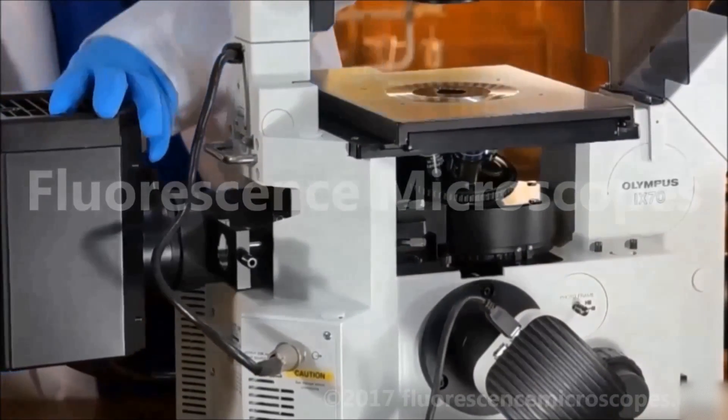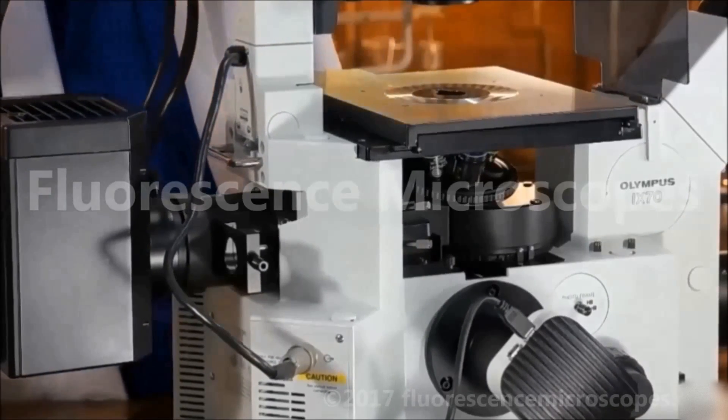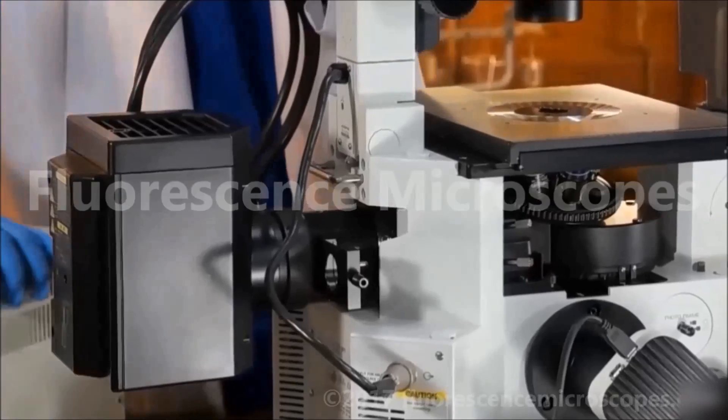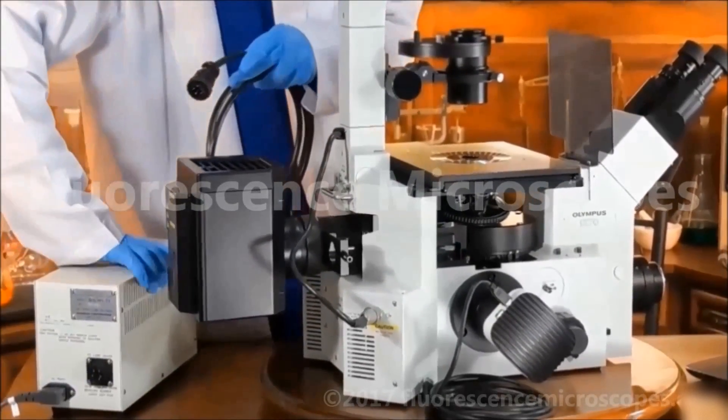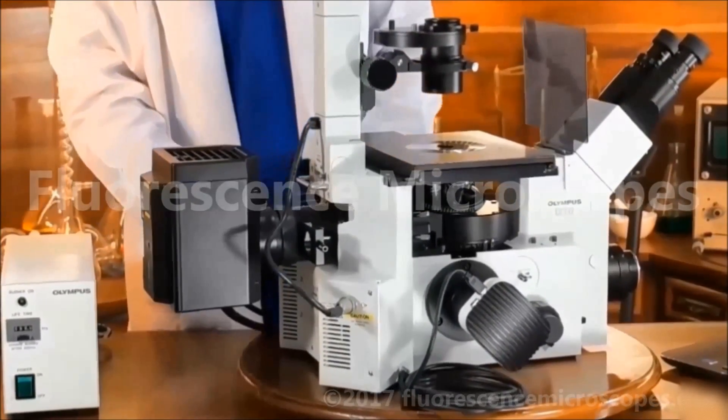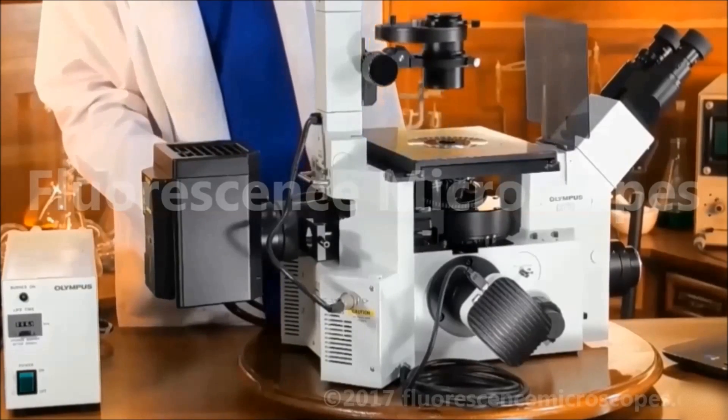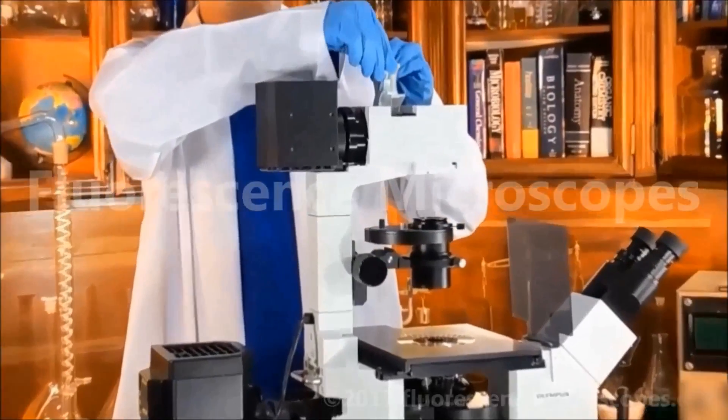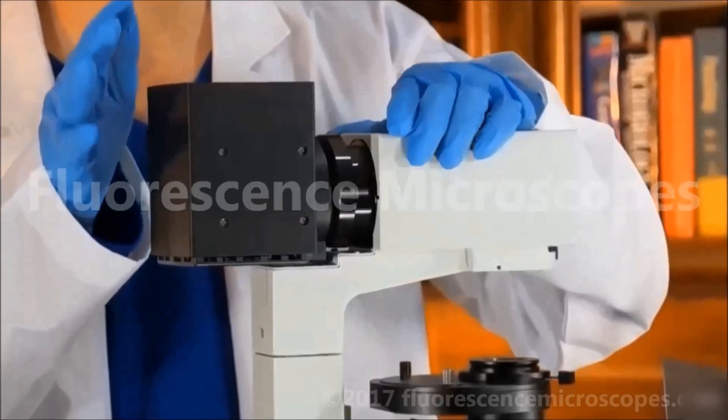This mercury lamp housing is connected to the power supply by this cable. Here's the connection. We have some filters. Light balancing daylight filter plus a frosted filter included for the halogen.